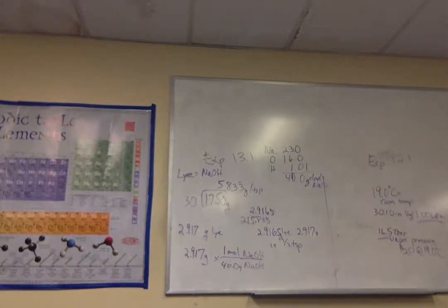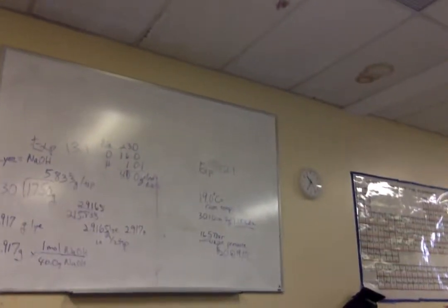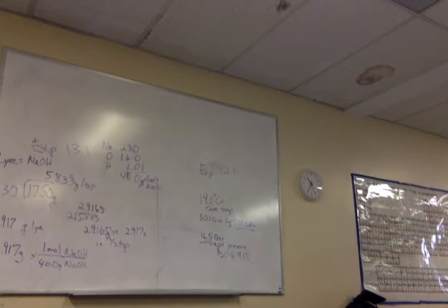And now I'm going to put the half a teaspoon of lye in. If you don't have the moles, you just calculate that, right? I'm going to see what the temperature comes out as.